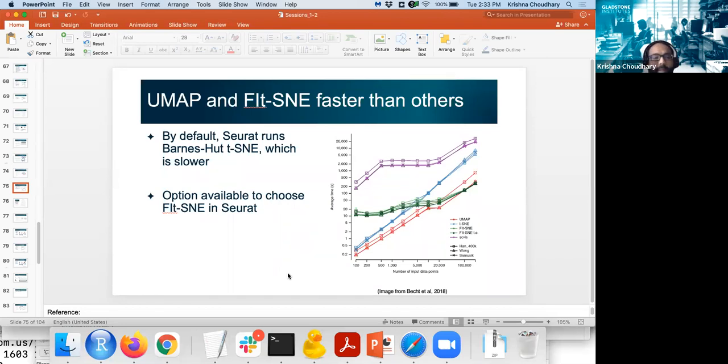So in all the projects that we have done, we have not always tuned these parameters, which kind of bothers us, I guess, but there are budgetary constraints and practical limitations, because of which in many studies you will find that folks are oftentimes running with default parameters and not tuning.